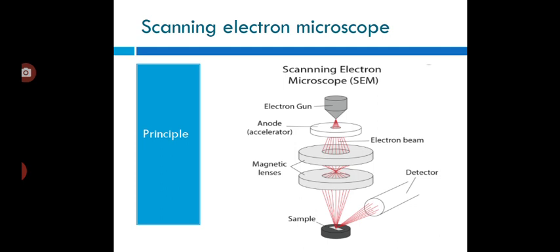The signal used by a scanning electron microscope to produce an image results from interactions of the electron beam with atoms at various depths within the sample. Various types of signals are produced, including secondary electrons, reflected or backscattered electrons, characteristic X-rays and light cathodoluminescence, absorbed current, that is specimen current, and transmitted electrons. Secondary electron detectors are standard equipment in all scanning electron microscopes, but it is rare for a single machine to have detectors for all other possible signals.